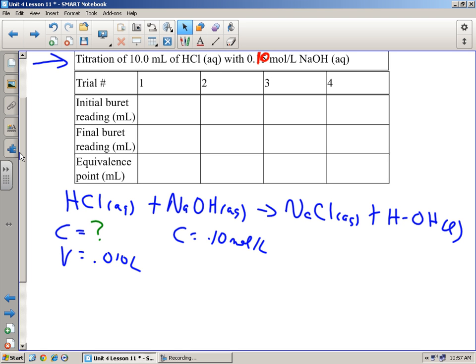No, because it's aqueous, yeah? Are you going to see water being formed? That looks like water to me too, doesn't it? It's acid, but obviously there's some water in there. So you can't forget the indicator, because otherwise you'll see nothing. Okay? So 2 drops of indicator is all that you need. Maybe even 1 drop would be enough, but usually we say 2.